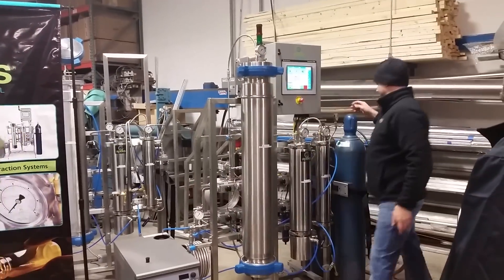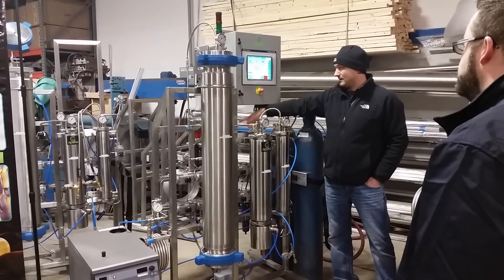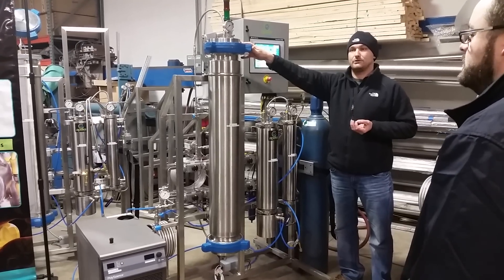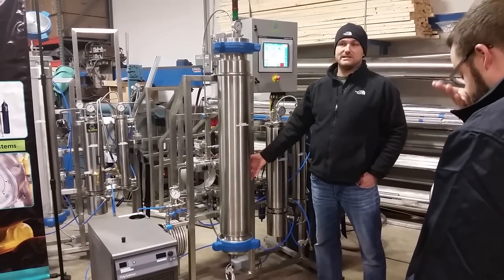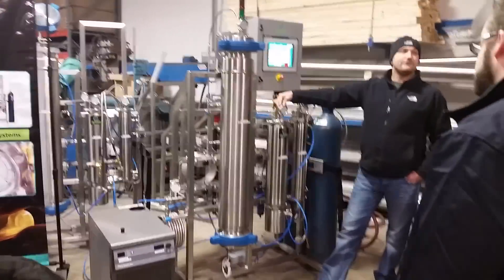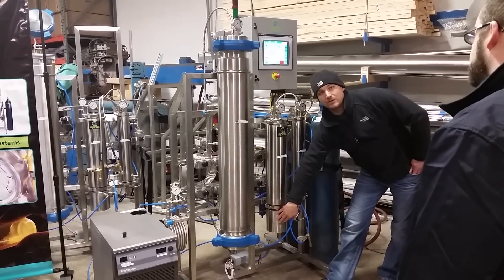We've locked everything down. What happens is we take the CO2 out of your bottles over here, we use a pump in the back, and we compress the CO2 in the extractor above 1000 psi where it's liquid or supercritical. That liquid or supercritical CO2 runs across all the plant material. It works as a solvent when it's a liquid. We then bring that CO2 over into our separators where it's only 200 to 400 psi. The CO2 will flash back to gas and all your oil from your plant material will fall out into a collection cup.